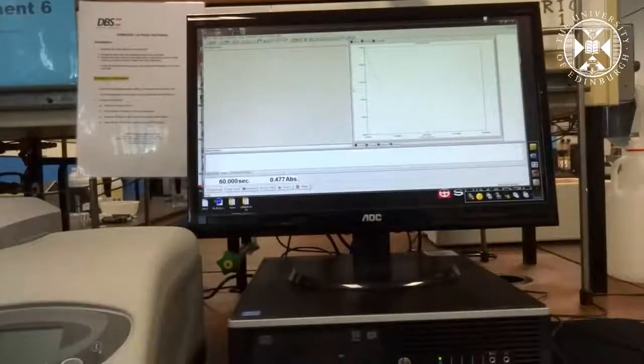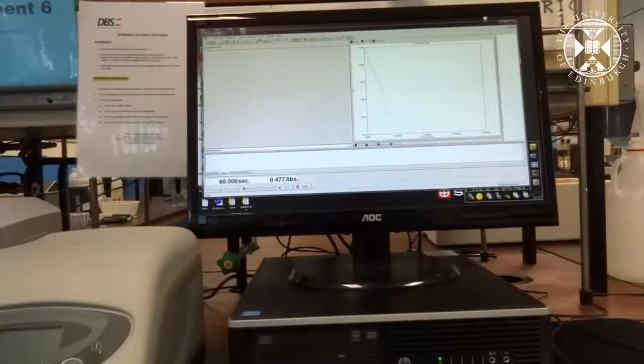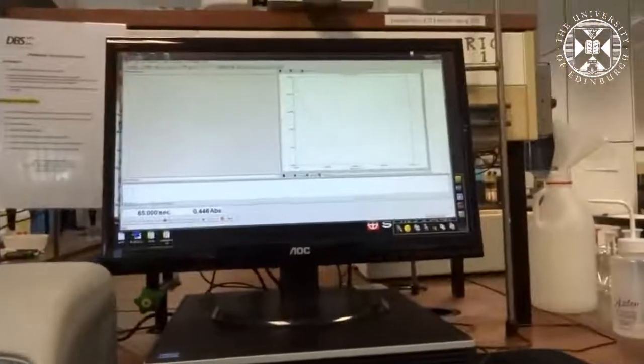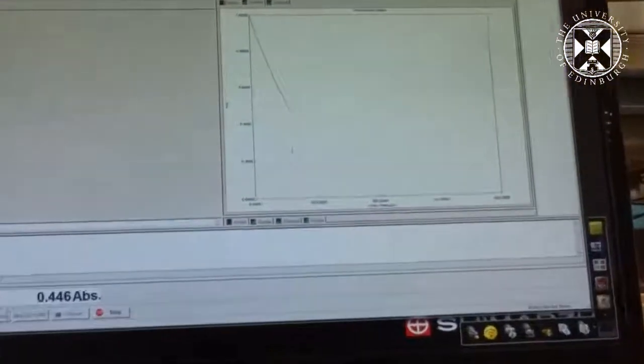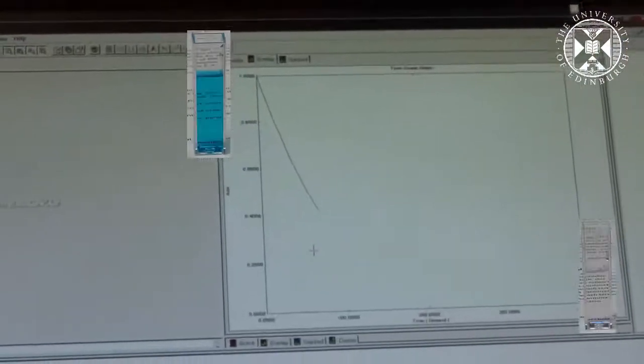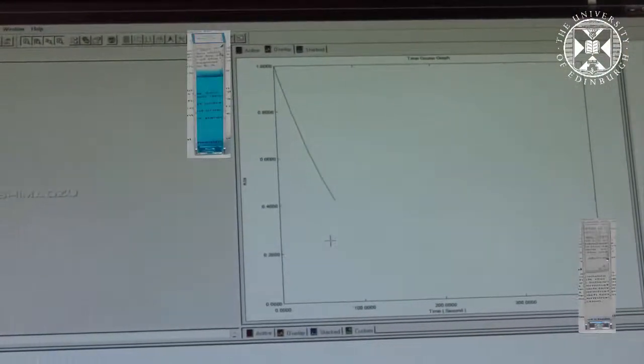You will notice the kinetic trace. This is monitoring the decrease in absorption and hence reflecting the change in concentration at the wavelength of maximum absorption over time as the malachite green is hydrolyzed to the carbonyl.